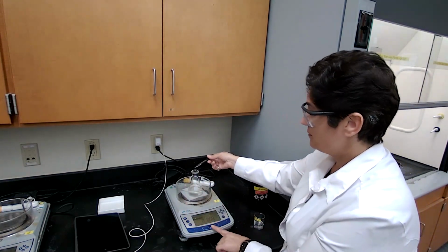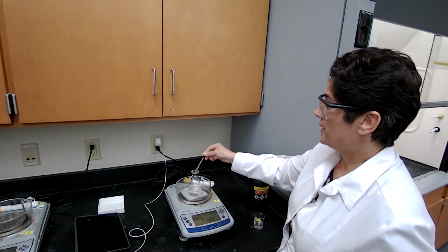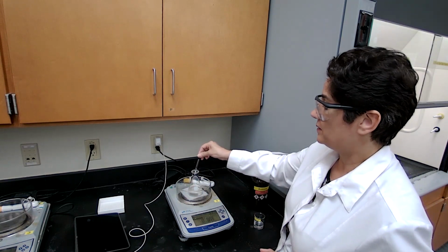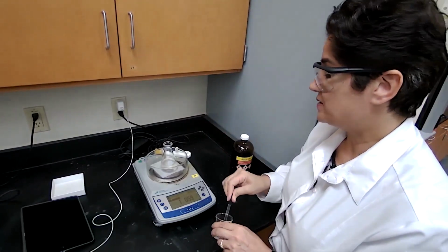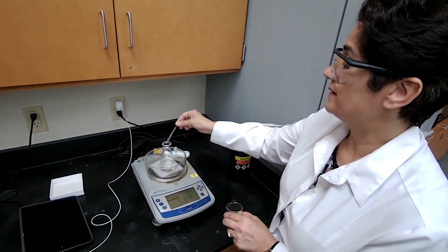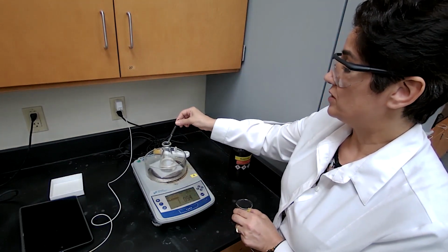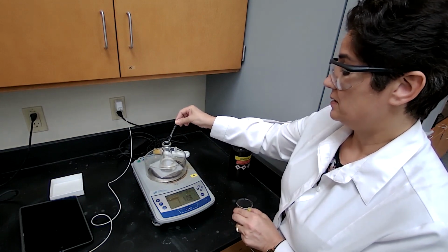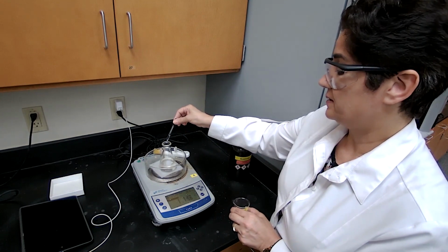So I'm adding drop by drop until it reaches the desired number. Okay, that's 1.034. Now I have to slow down, adding one drop at a time, looking for the number that I want.